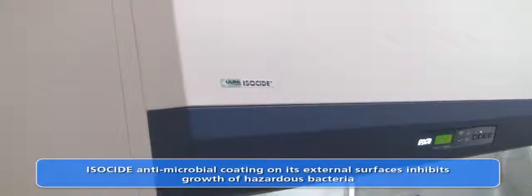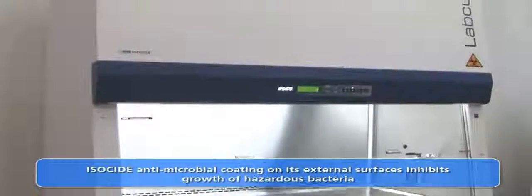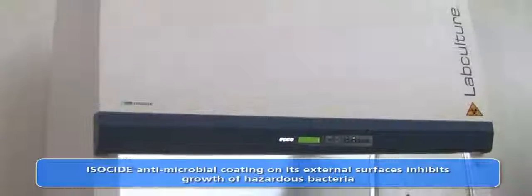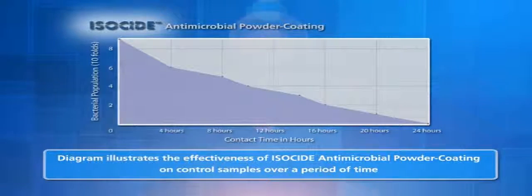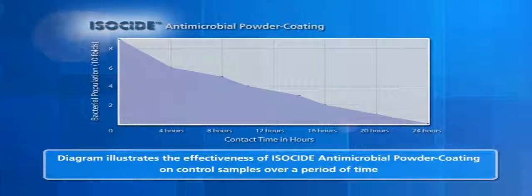The isoside powder coating on the cabinet exterior dramatically inhibits the growth of bacteria, thereby ensuring no cross-contamination occurs due to contaminated surfaces. The diagram illustrates the effectiveness of isoside against controlled samples of E. coli and Staphylococcus aureus, commonly known as Staph bacteria.